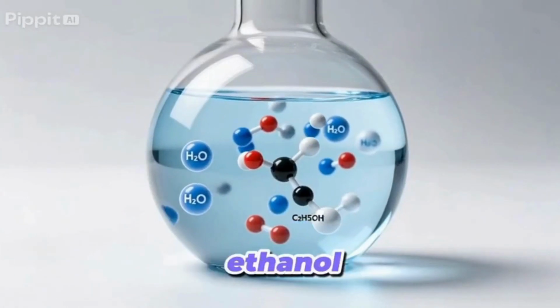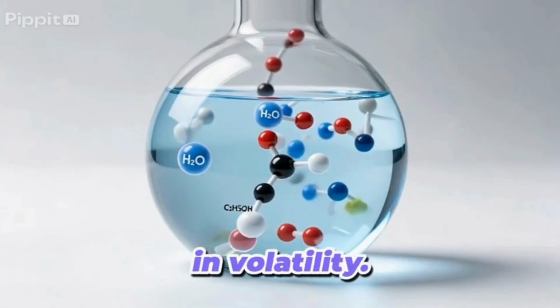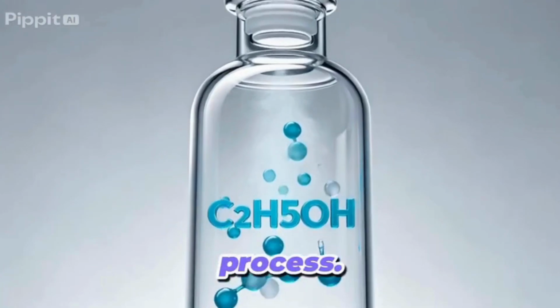Need to separate ethanol from water? The key is their difference in volatility. In batch distillation, we heat the mixture. The vapor rises, starting the separation process.